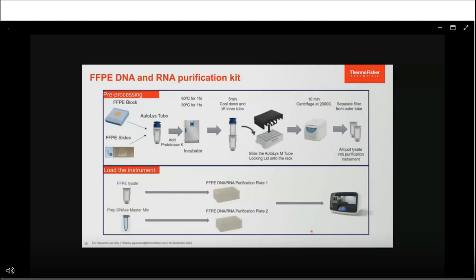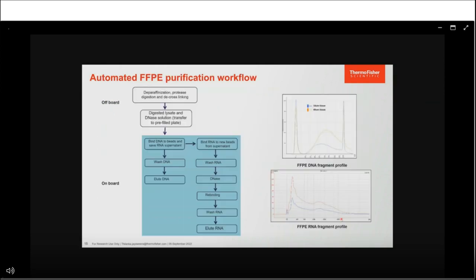Here is an overview of the whole process of extracting DNA and RNA from FFPE samples. After preprocessing and obtaining the lysate, you add it to plate 1 of the FFPE DNA/RNA purification kit. You also prepare a DNase master mix using kit reagents and add it to plate 2. These two plates are then loaded to the purification system along with consumables. On board, if extracting both DNA and RNA sequentially, DNA first binds to the beads due to preferential binding in the buffer being used, then is washed and eluted. The RNA is retained in the supernatant, bound to new beads, washed, remaining DNA is digested with DNase, and the cleaned RNA is rebound, washed, and eluted.